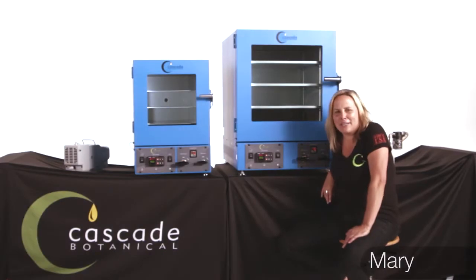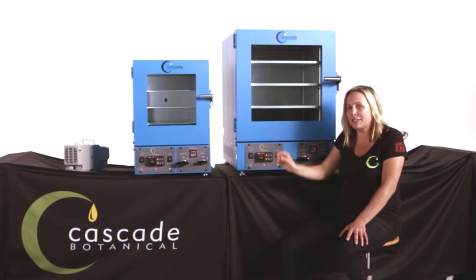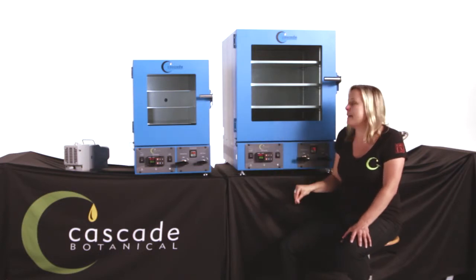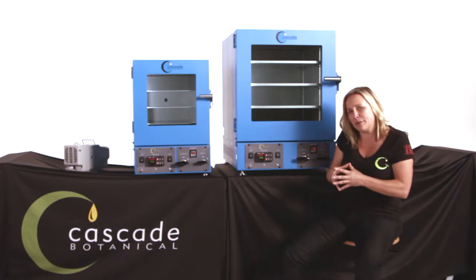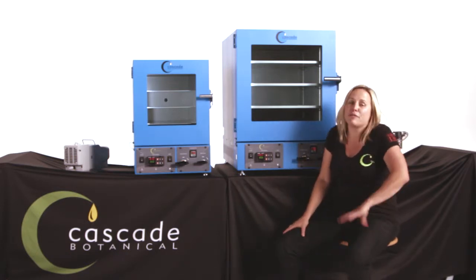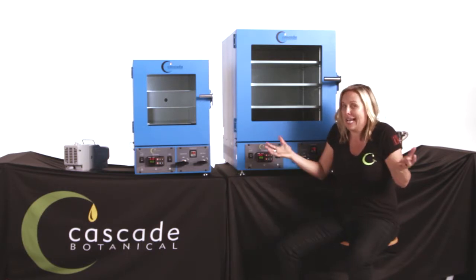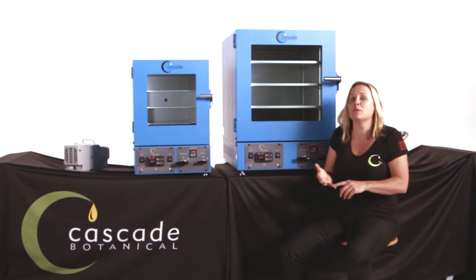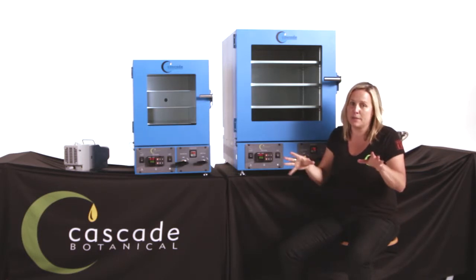Hi, I'm Mary with Cascade Botanical. I'm going to tell you what's new with our next generation of TVO2 and TVO5 vacuum purge ovens. This is the first generation of vacuum purge ovens we've designed specifically for professionals in the cannabis industry, or really anyone who's just looking for repeatable, consistent results time after time, run after run.